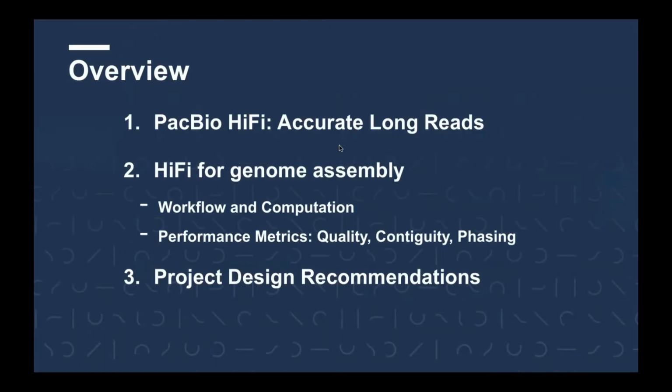So I'll begin today with an overview of the PacBio HiFi data type. Then I'll show you how HiFi reads can be used for de novo genome assembly, the advantages in terms of the workflow and the computation, and how HiFi data performs in terms of assembly quality, contiguity, and phasing. And then I will conclude with project design recommendations on the new Sequel II system.